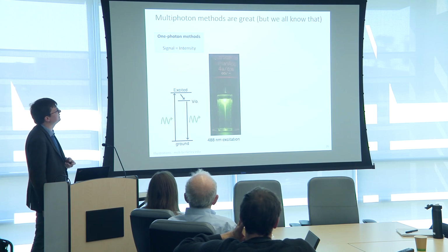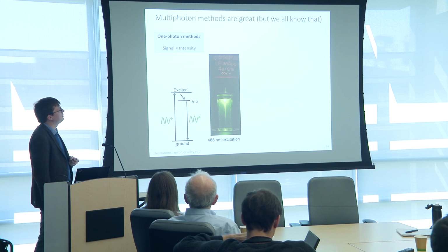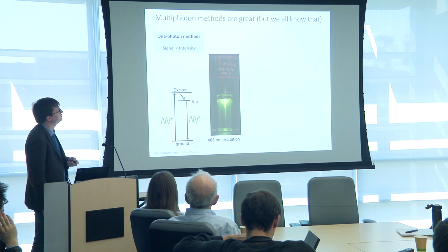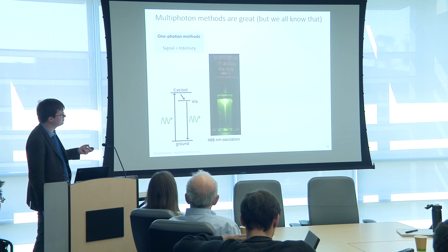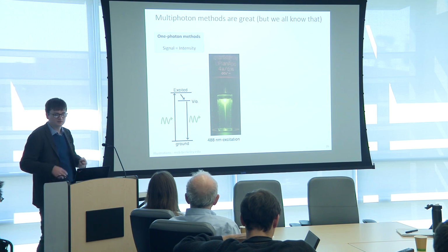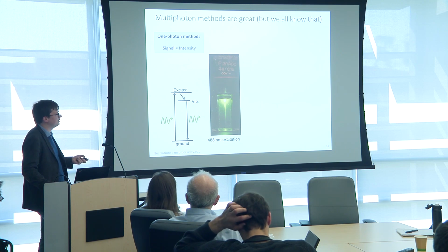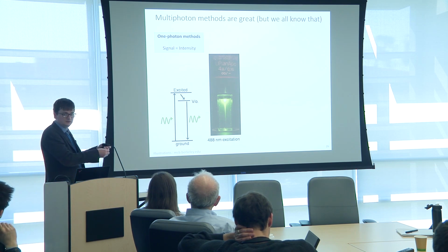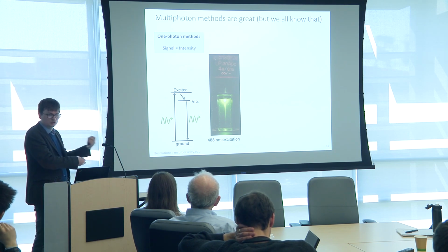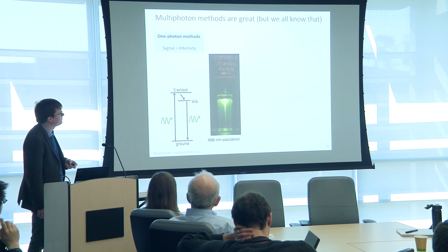So we first start by saying that we need a multiphoton technique. Why is multiphoton microscopy so interesting? The idea is that in brain tissue, which is, for instance, very well simulated by a suspension of fluorescein, there's lots of autofluorescence, there's a lot of absorption, there's lots of diffuse optics going on. Namely, if you're trying to shoot light at a neuron that is deep in the brain, the photons you're sending in are very likely to never make it to the target, either because they're absorbed or because they are deflected towards another direction by the structure of the tissue itself.